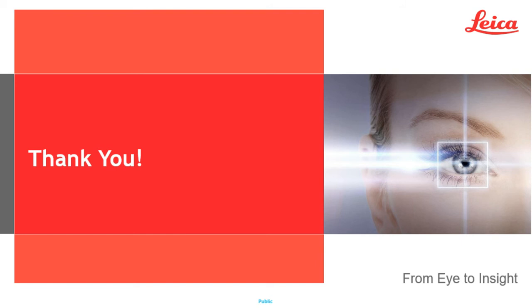So again, there's quite a bit of variation here, and it really depends on what it is you're looking for and how different they are. From the machine learning and deep learning perspective, the clearer the distinction between what you're looking for in the background or cell A versus cell B, the fewer examples you will need.